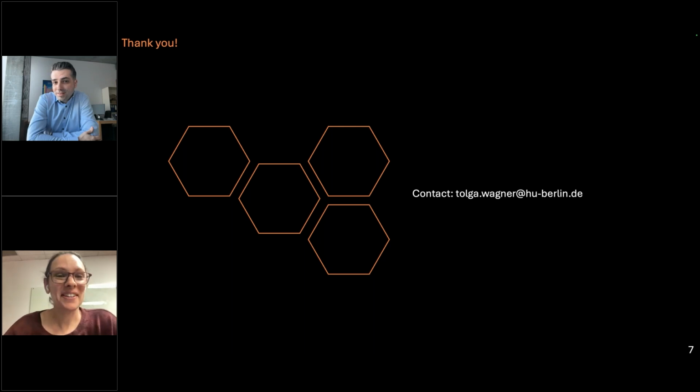They responded with thank you. So I think that answered the question. There was another question that was sort of along the same lines. I think you may have covered it, but I'll ask it anyway. It was referring to the thinning of the lamella, and were there any concerns that how thin you made it affected the phase shifts that were measured or the measurements that you were making?